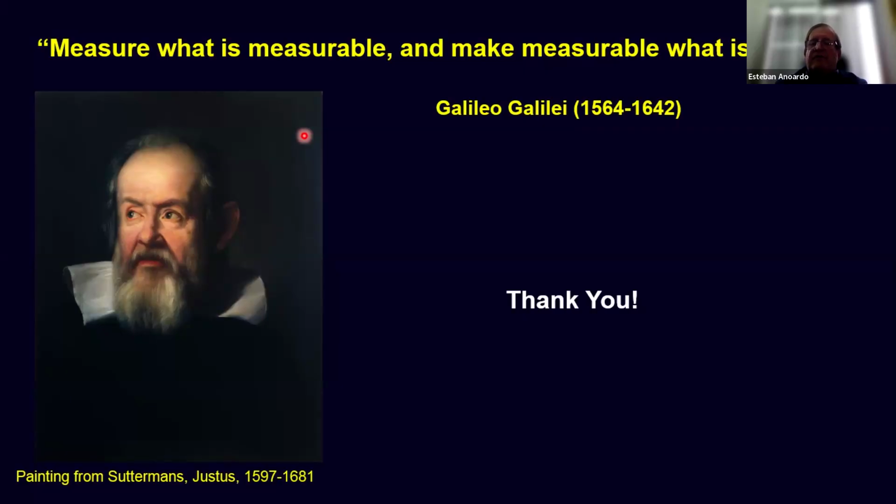Anyway, I think there are models that have been used many times where the results extracted were consistent with other values reported in the literature using other techniques. And this was not even tried in that moment, okay? You know that the main problem from the laboratory of Stuttgart was that people never trust too much these fitting processes with so many parameters, because it is a matter of discussion, of course. That's why the validation of the model is so important.